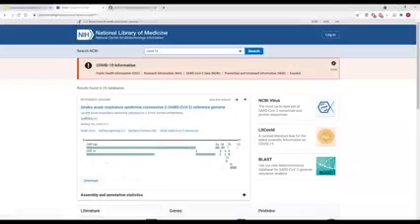And it has this diagram basically showing in black the length of your sequence, and in green, which areas of your sequence code for specific things. So for example, the bases from here to here of the sequence code for the ORF1AB polyprotein. From here to here codes for the ORF1A. And here to here codes for the surface glycoprotein, and so on and so forth. So open a new tab.